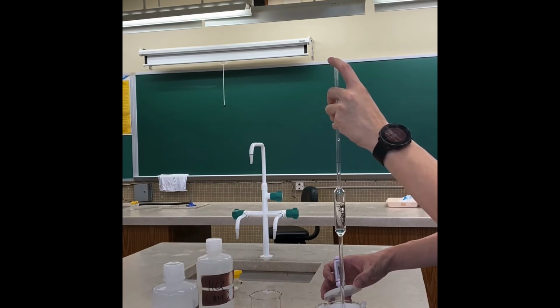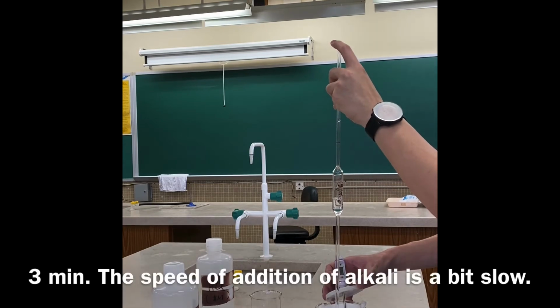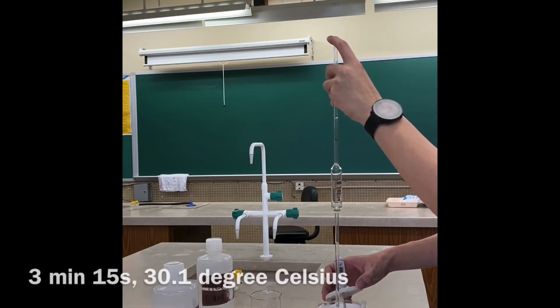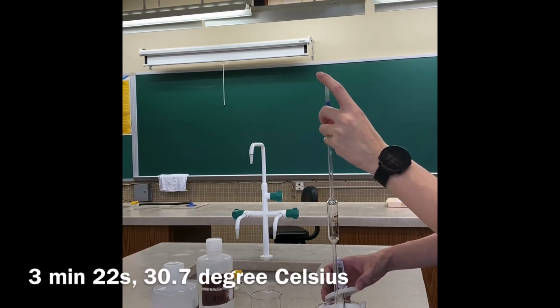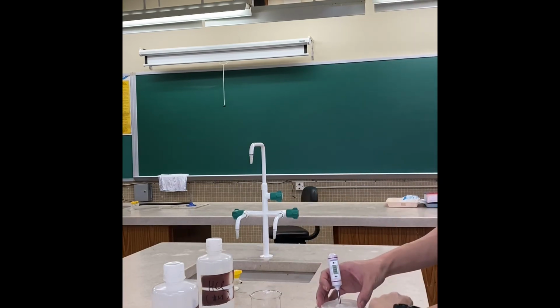The temperature now rises to 26, and 27 now. And then 28.8 now. 29.3. 30.1. 30.7. 30.8. Immediately after the addition of the alkali, just cover it and then record the temperature.